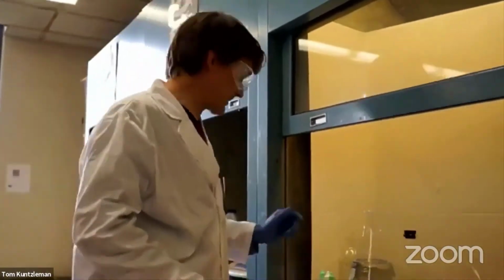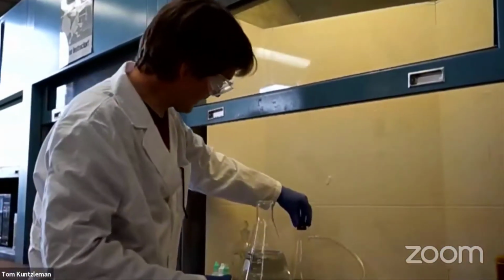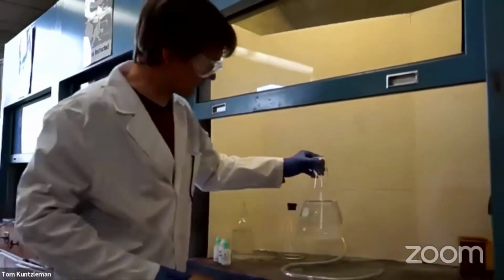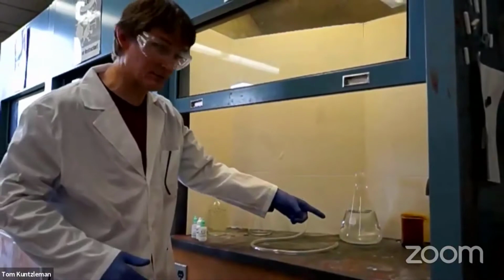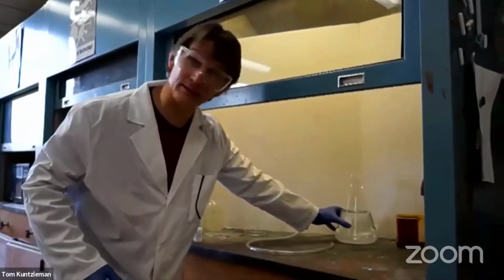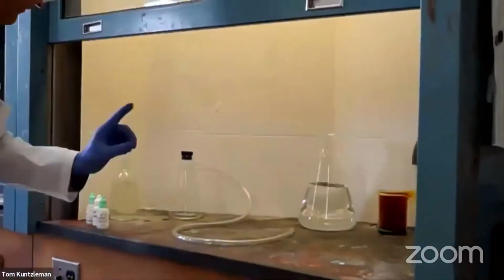All right, I want to try this experiment in a little different way. We're going to do the same experiment. This one's still running. But this time, I'm going to try to collect the gas that comes out, and we're going to get it in this water that's here. And I want to treat this water a little bit specially first.